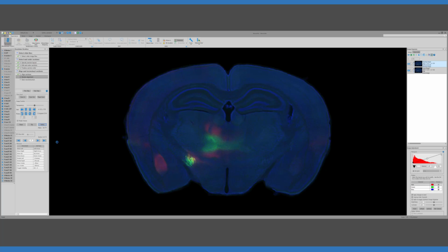So even if you didn't use the image content initially, you can use that at this point where we'll try to refine the rotation and translation, and just try to optimize it basically to get a better match. Right.